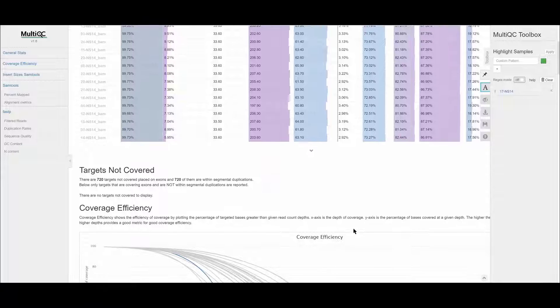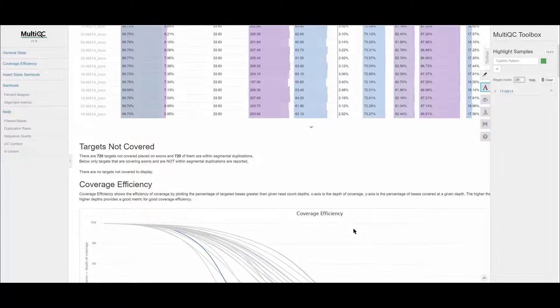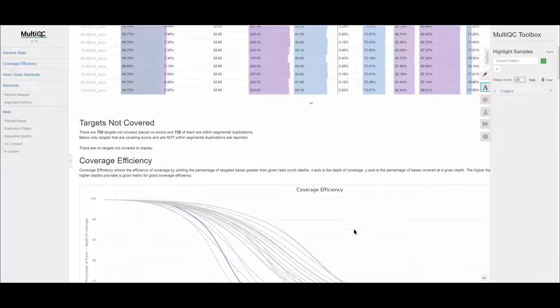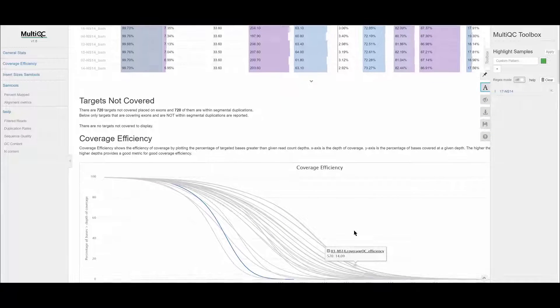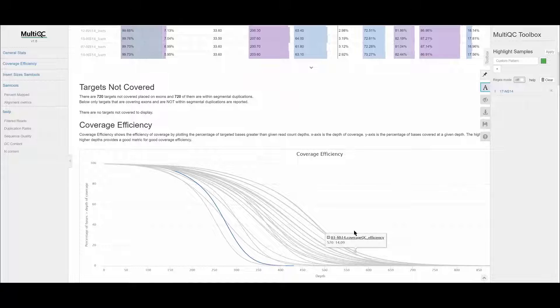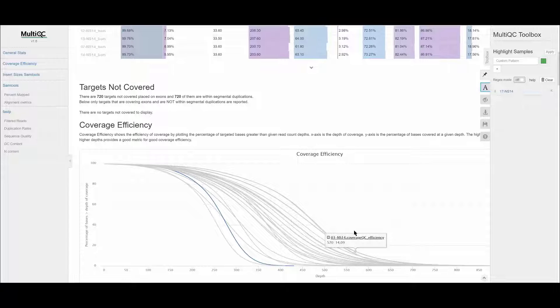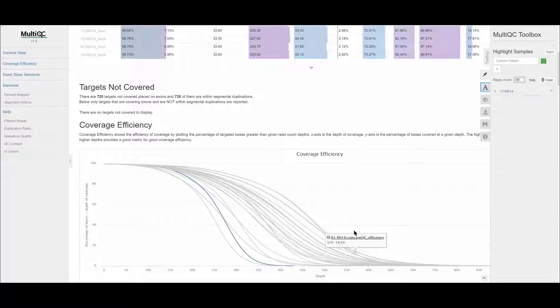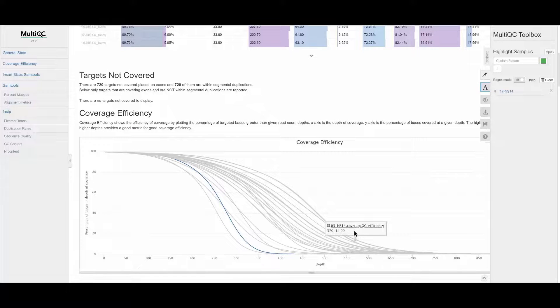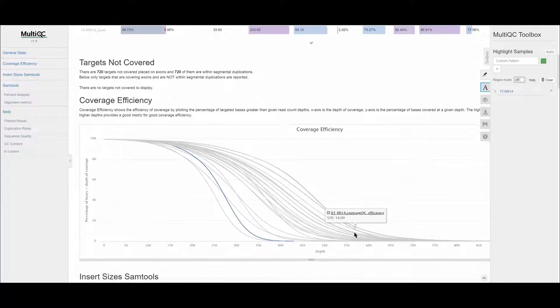Below the table, the report has been formatted to display several important metrics which should be reviewed first to ensure the overall sample and batch quality is acceptable. These displays are the targets not covered, the coverage efficiency, and the insert sizes. And descriptions of these metrics are given in the report.